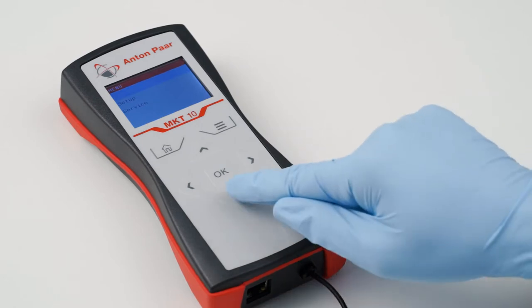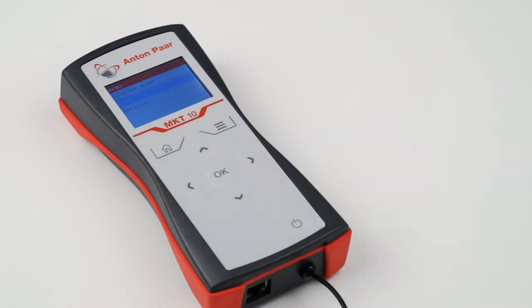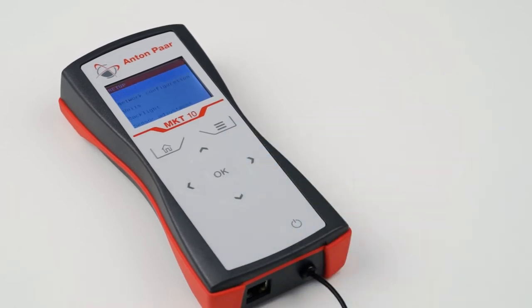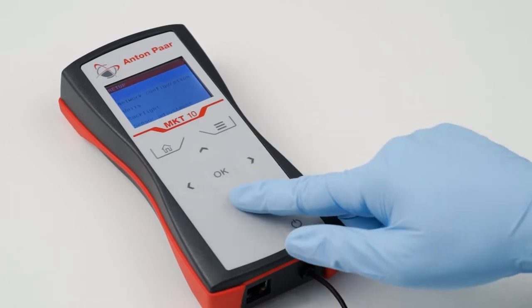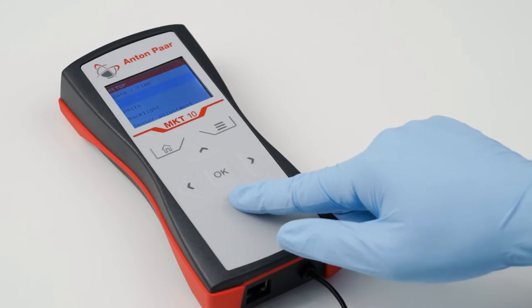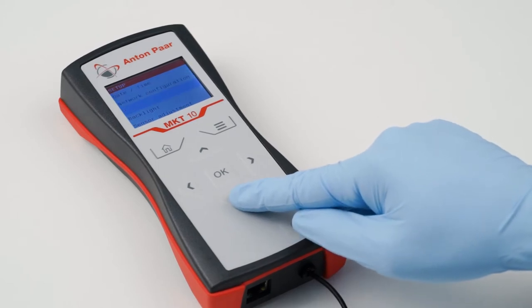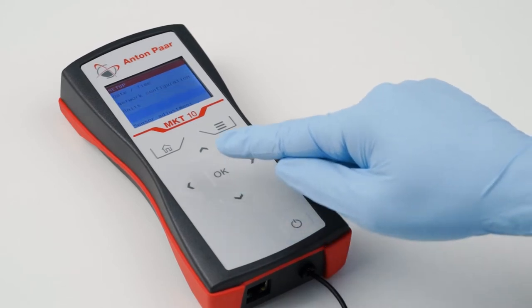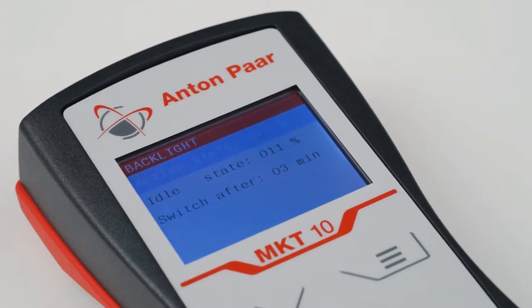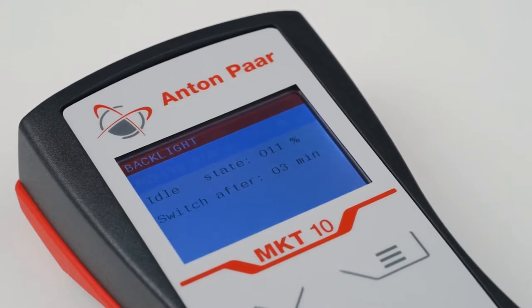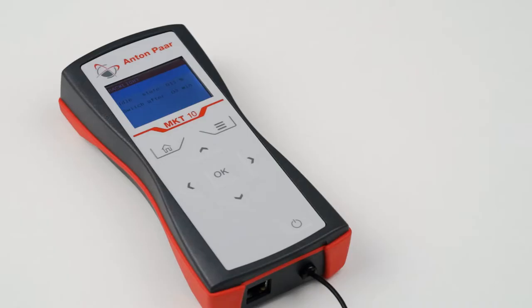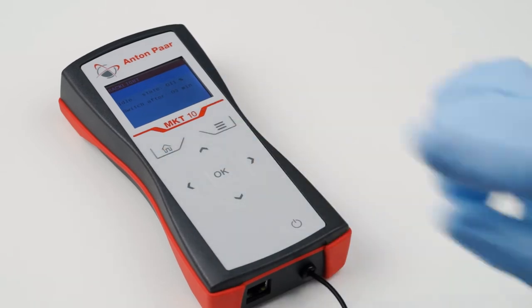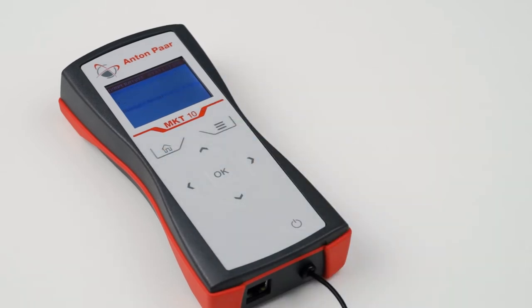In the same way, it is also possible to configure your network settings, to choose between the three different units, or to adjust the display brightness. Press home to return to the main screen.